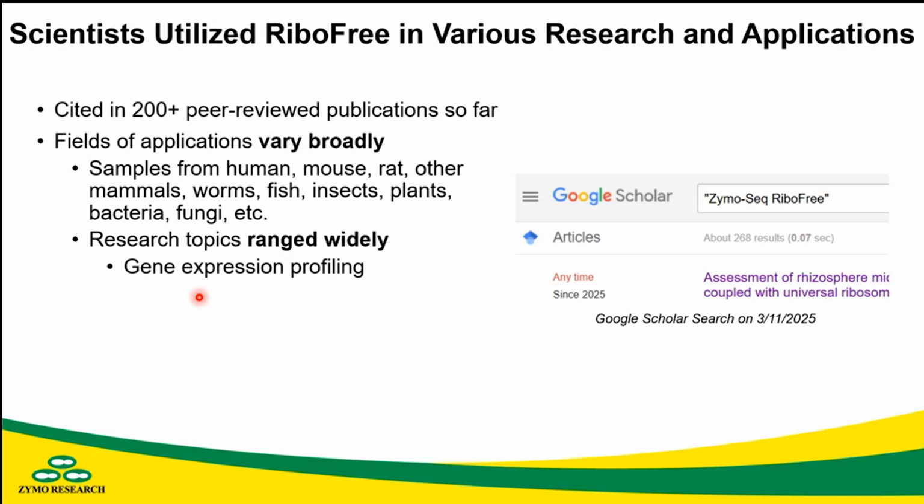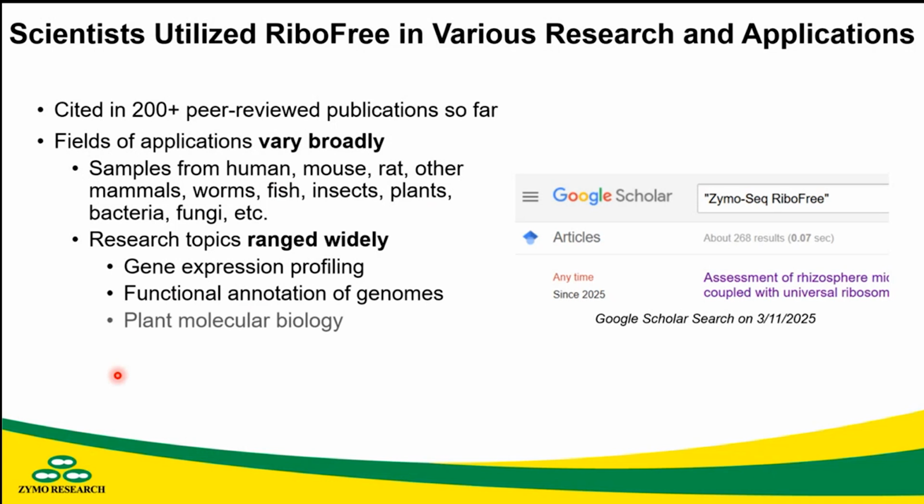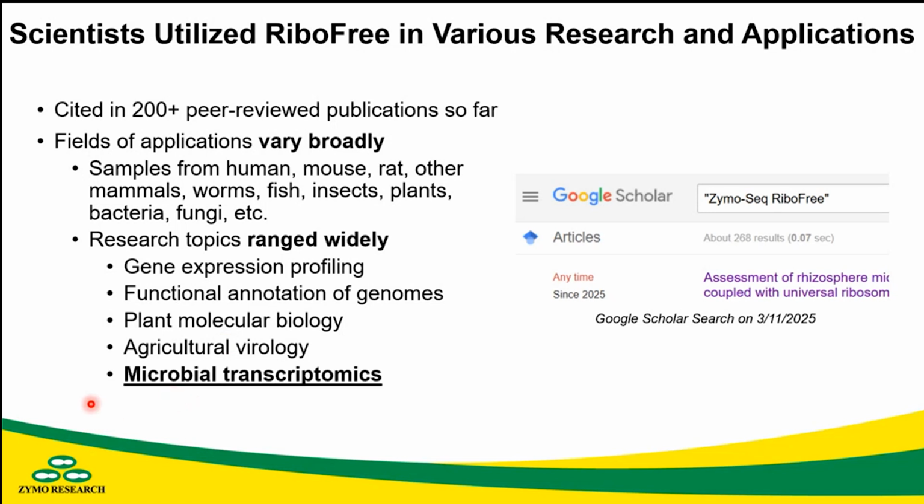We have, of course, the regular use case for RNA-Seq, that is to do gene expression profiling, quantifying the transcriptome levels. But I also see the functional annotation of genomes. I've seen studies in the field of plant molecular biology. Not to mention agricultural virology is also on the rise. And of course, a significant portion of the publications are coming from microbial transcriptomics, among many other applications.